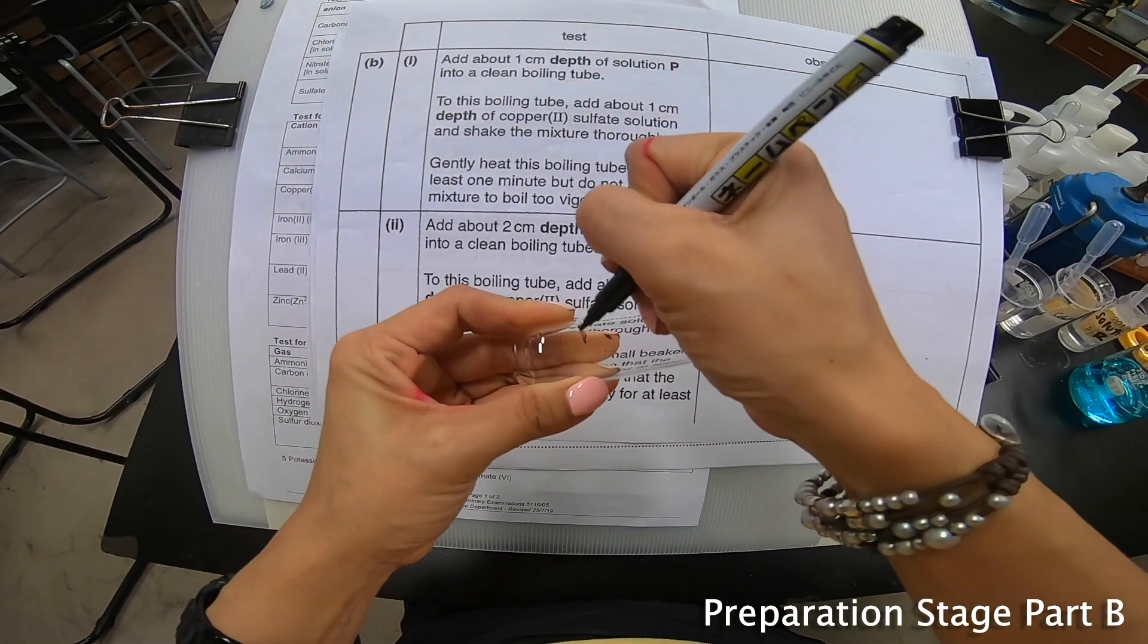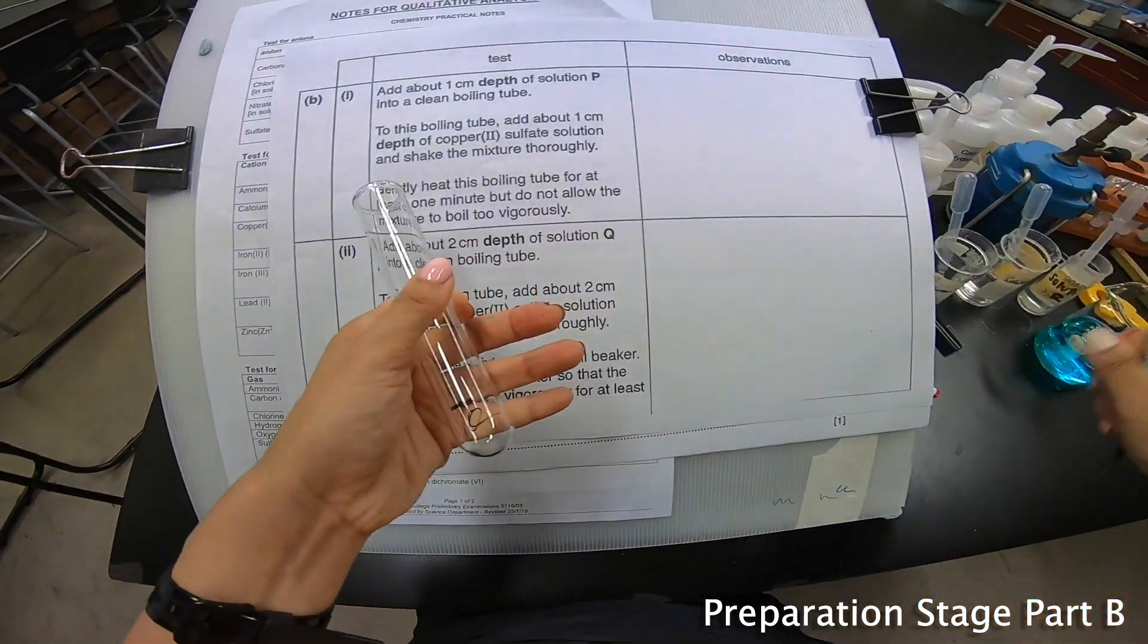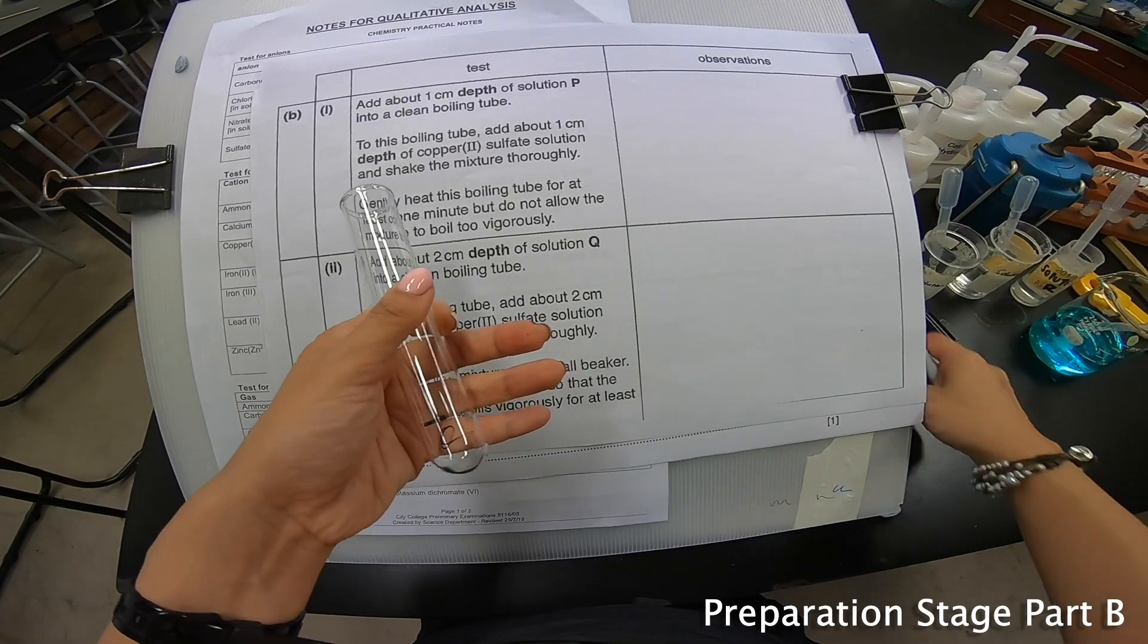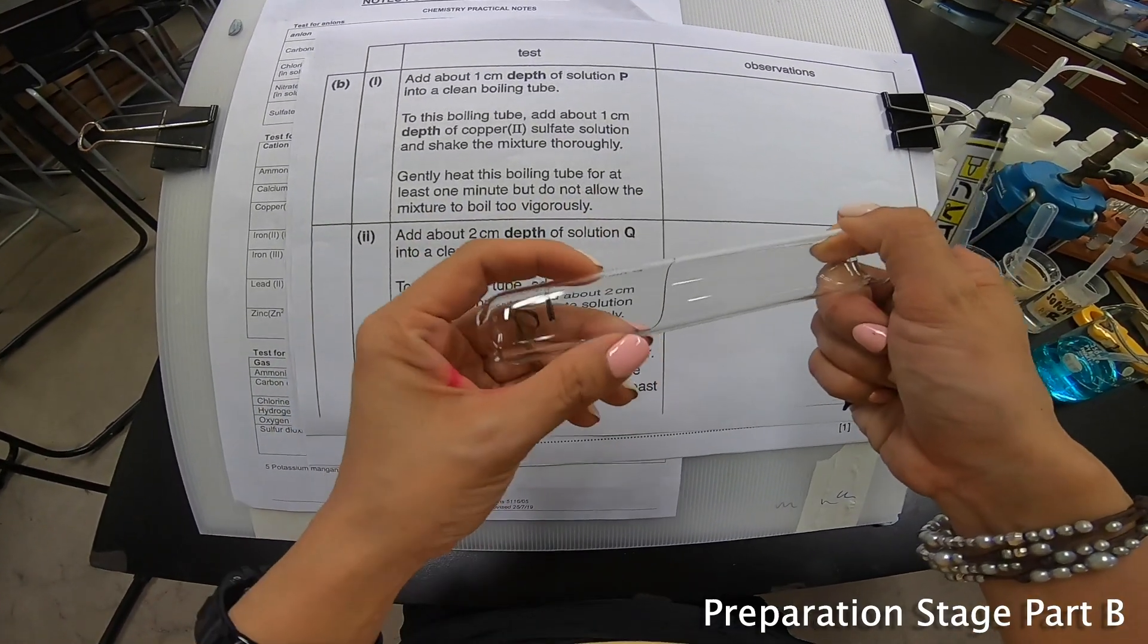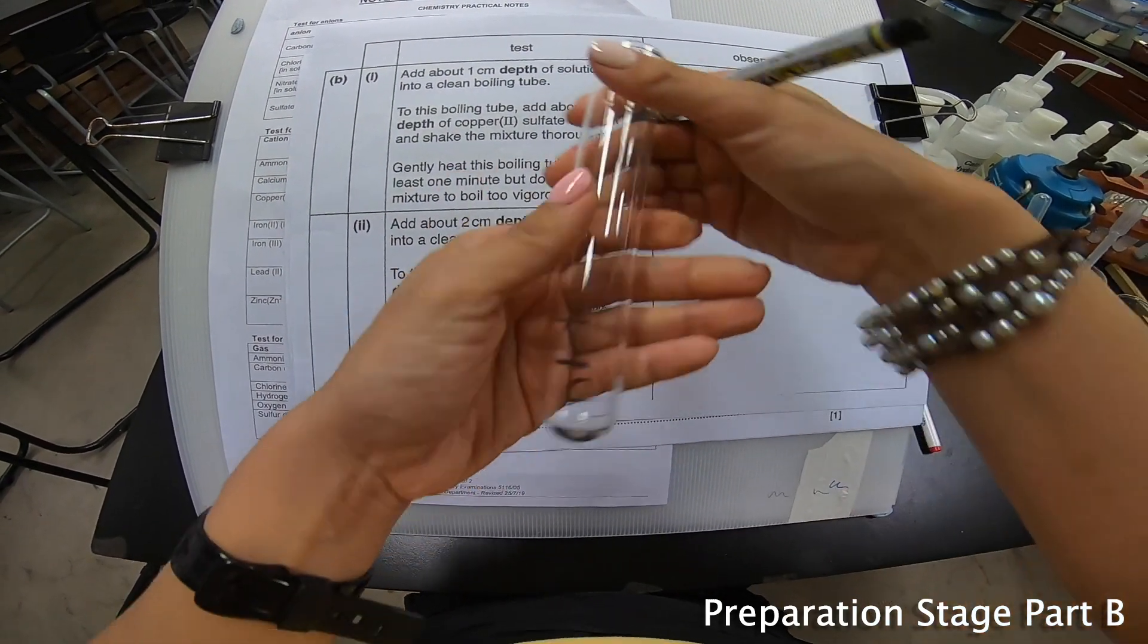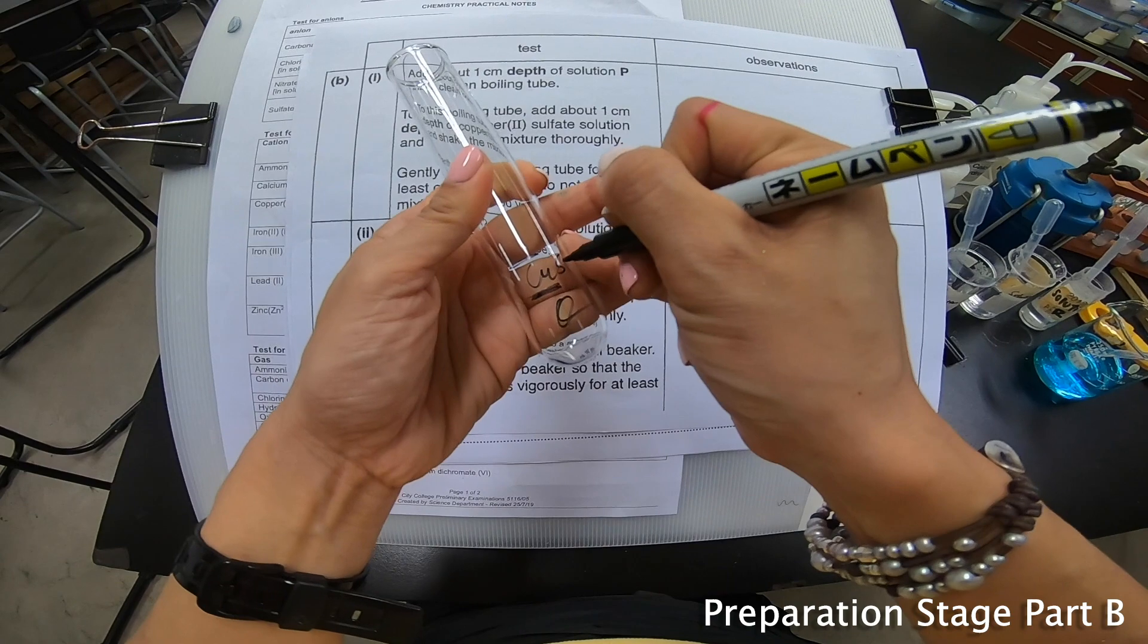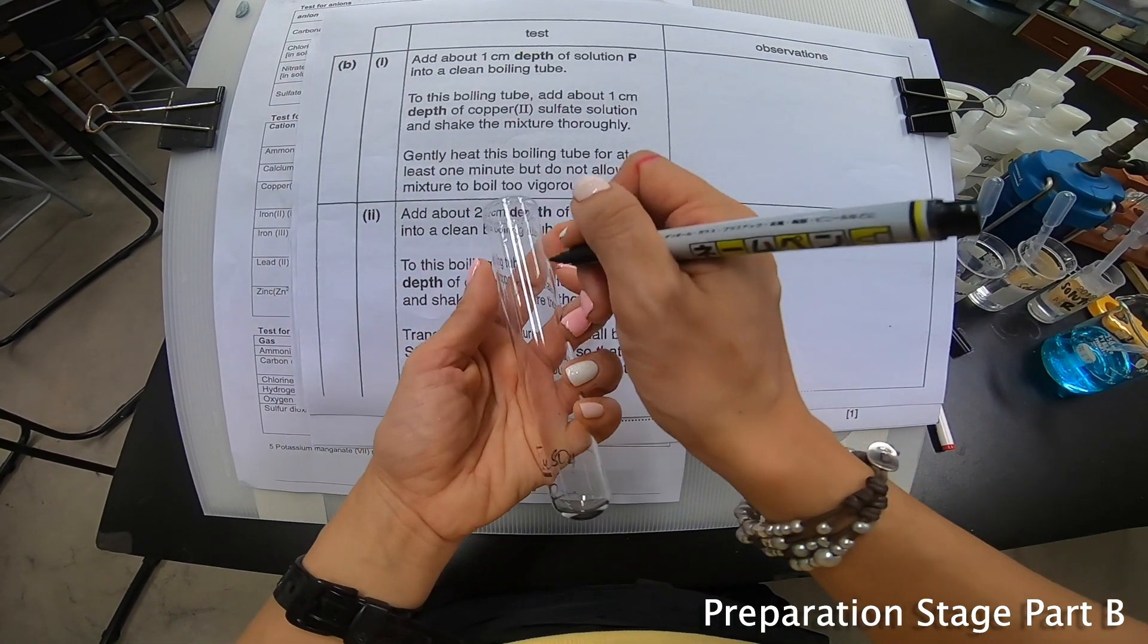And this is Q. Let me write this down. And then I'm supposed to add another 2 cm depth of CuSO4. So this is CuSO4. Now this part here is B part 2.